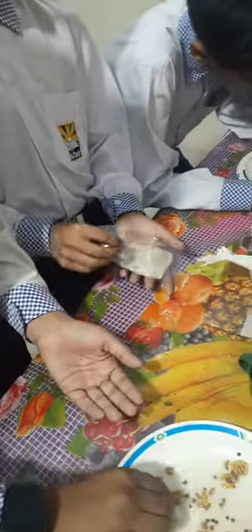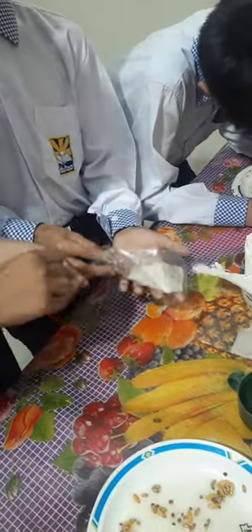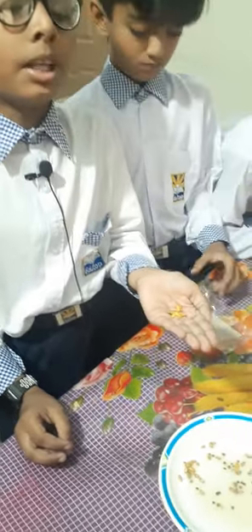Now we will take some kinds of seeds and put them in the paper towel. First of all, we need to soak them in water for 24 hours.